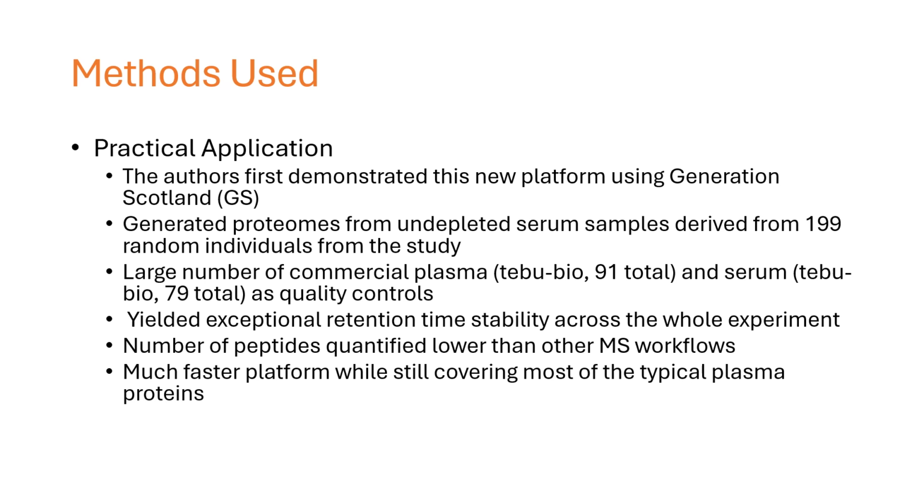They showed that their platform yielded exceptional retention time stability across the whole experiment. The number of peptides quantified was lower than other MS workflows, but it was much faster while still covering what they felt was the most typical plasma proteins.